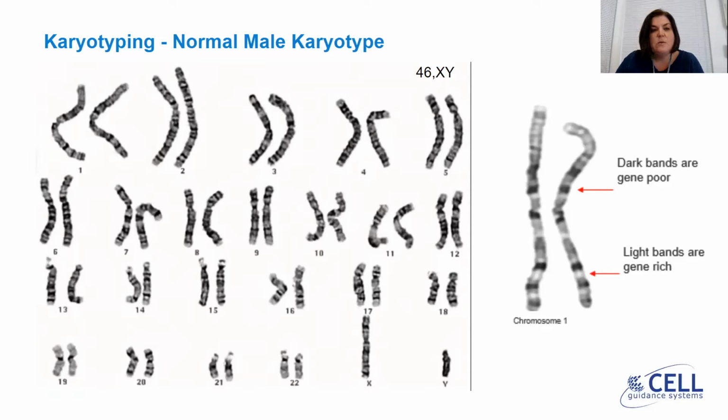So this is quite a nice cell. We would normally look at at least 20 cells for an analysis, and each cell would have all the chromosomes checked, and there would be an assessment of the quality. So this cell is probably a quality 4 to 5. This is because the number of bands, or the resolution present, is quite high.